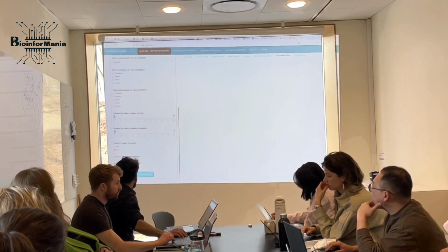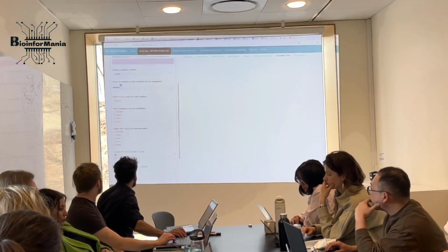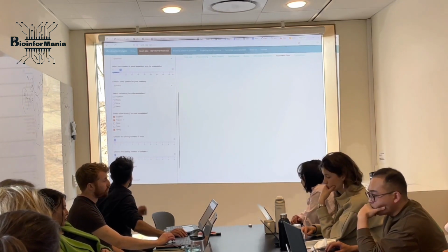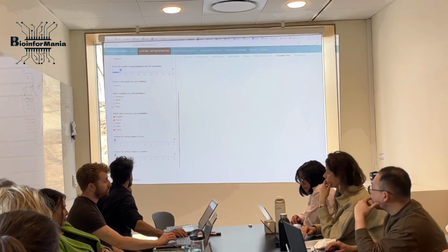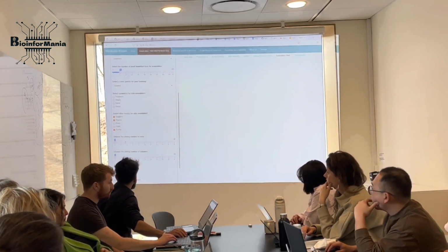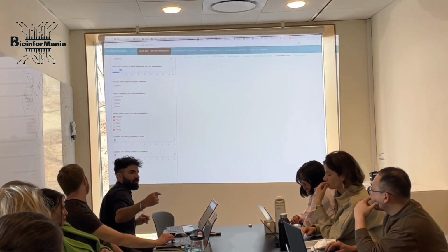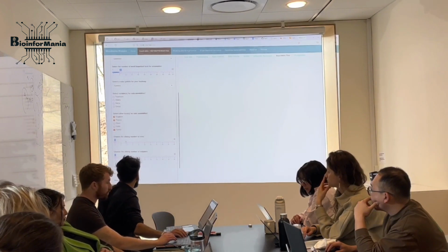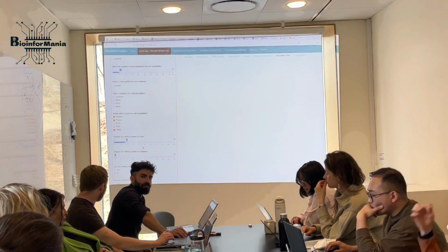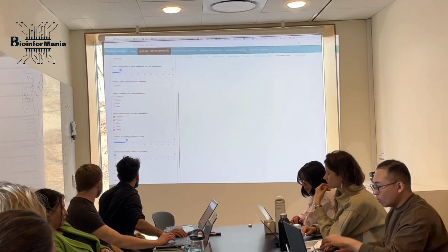Let's just, and then you can also bring some information, because this is genus. You can also bring some information of family and phylum and kingdom into it. Scratch this. This is completely redundant. Don't touch this. Nothing happens. And do you want to cluster the rows, which are your numerical variables? Yeah, I want to cluster. I want to see if, for example, body mass index clusters with blood pressure or not. And then give me the number of cuts. This you can play with later. Just let's go for 4.